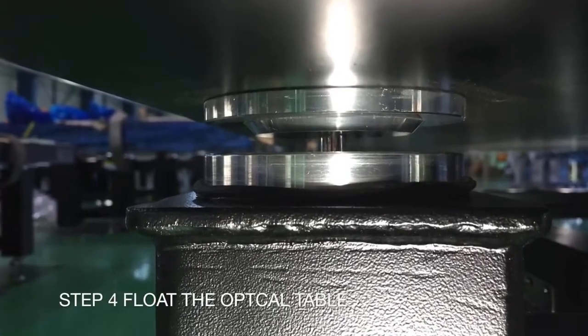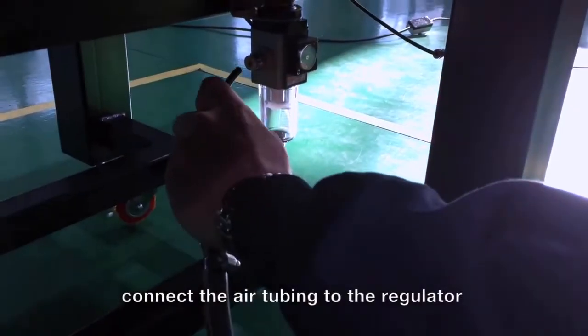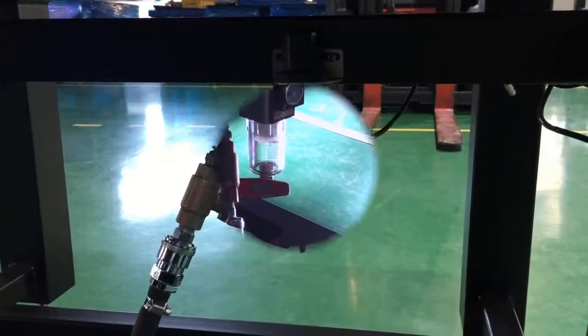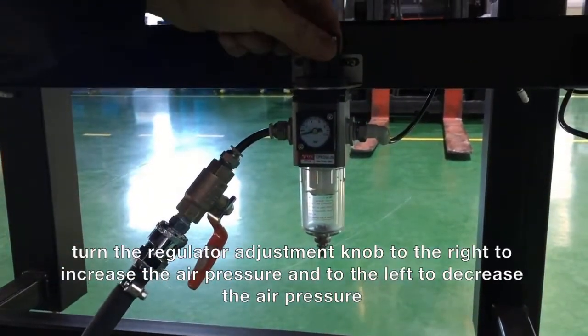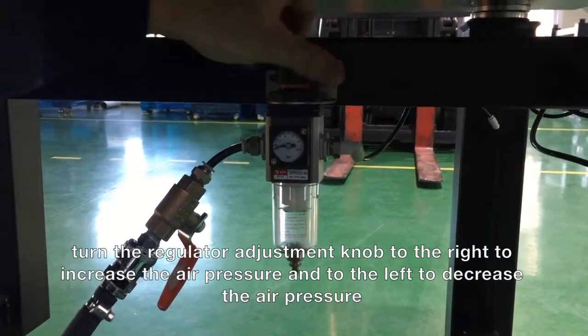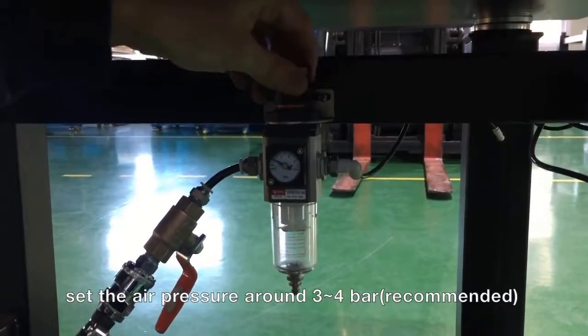Step 4. Connect the optical table to the compressed air supply. You will find the connection hoses and a small toolset in the scope of delivery. A small pair of pliers is ideal for cutting the tubes, with which you can simply clip off the tube. Connect the compressed air to the compressed air limiter. With the limiter you can precisely set the applied pressure. We recommend a pressure between 3 and 4 bars.